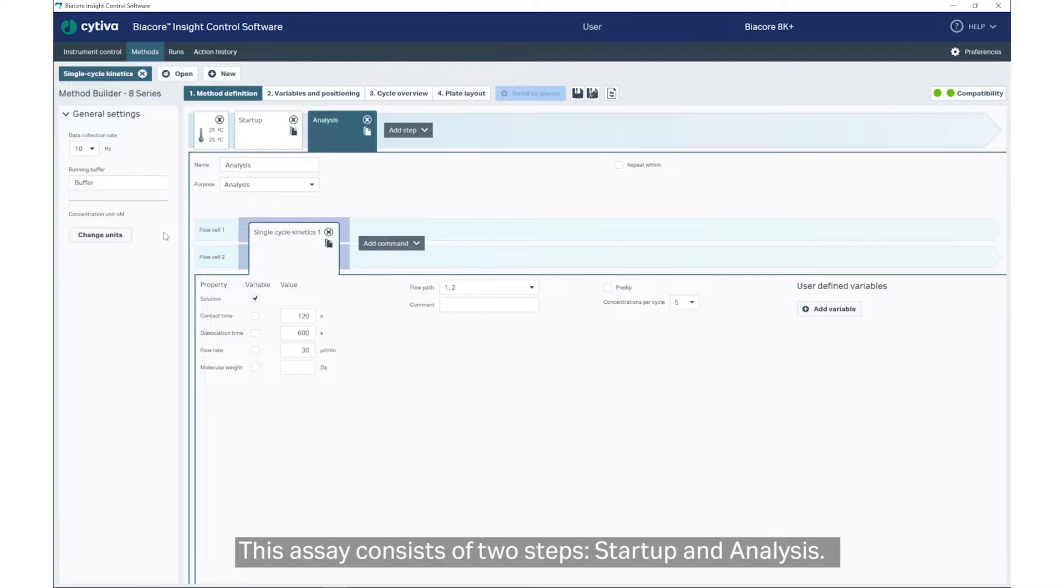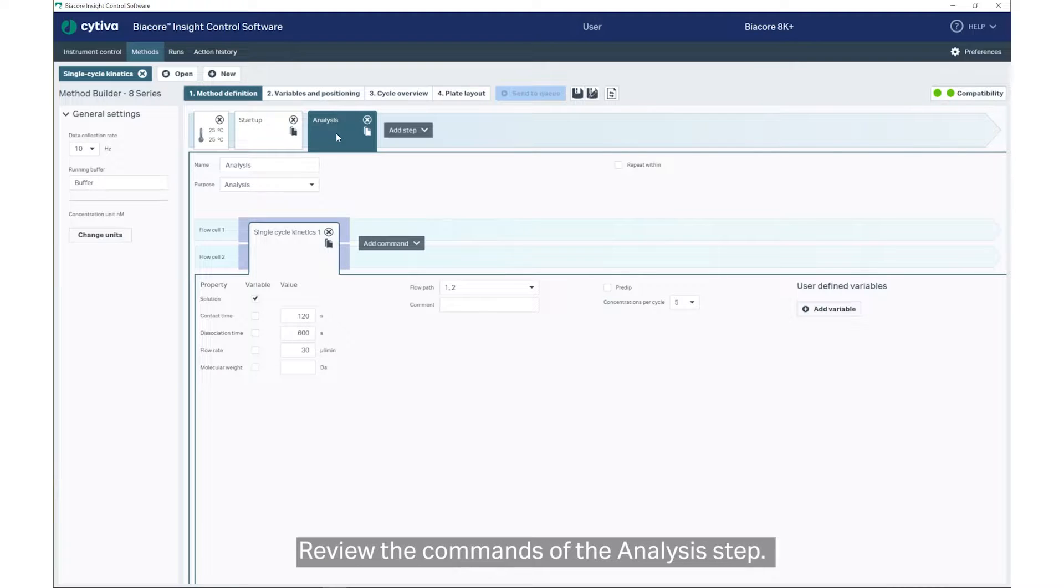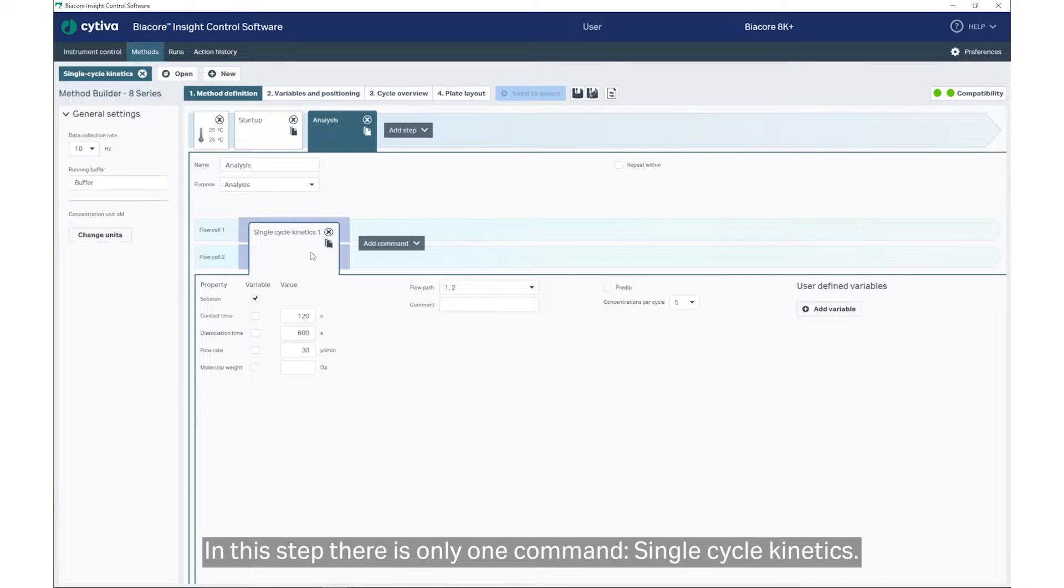This assay consists of two steps: Startup and Analysis. Review the commands of the Analysis step. In this step, there is only one command, Single Cycle Kinetics.